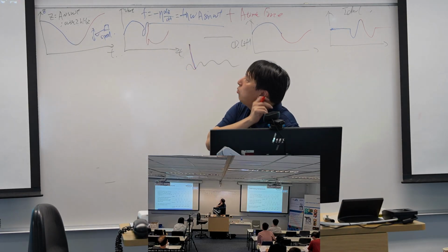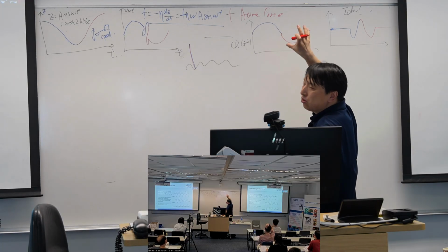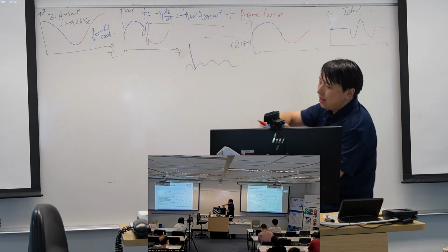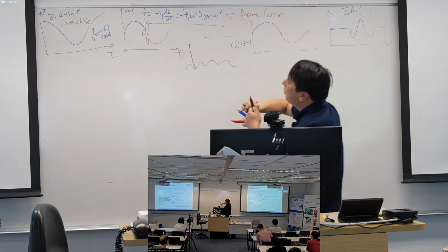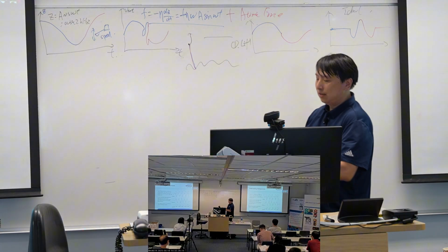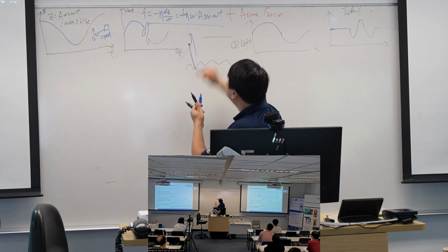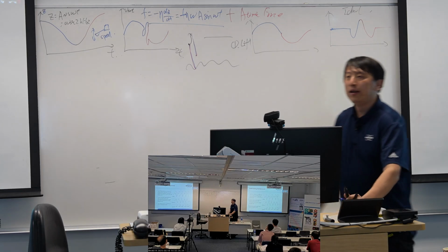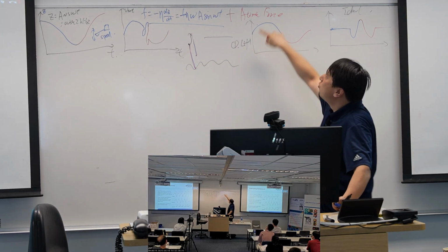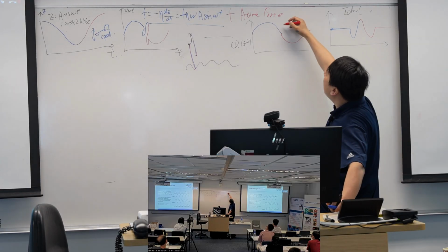To subtract the background, we need to get the background first. So the idea is, if I lift the probe by a distance, then when it moves down and up, it will not touch the surface. Then the vertical change against time will be pure hydrodynamic force.